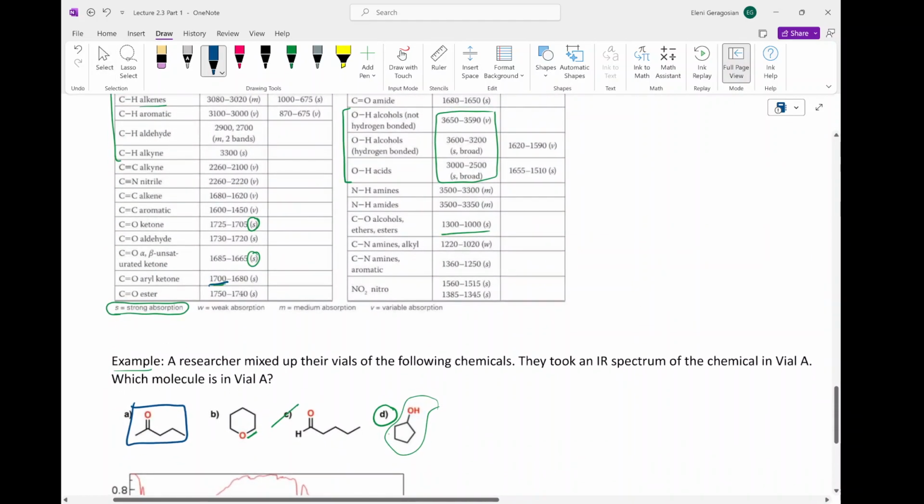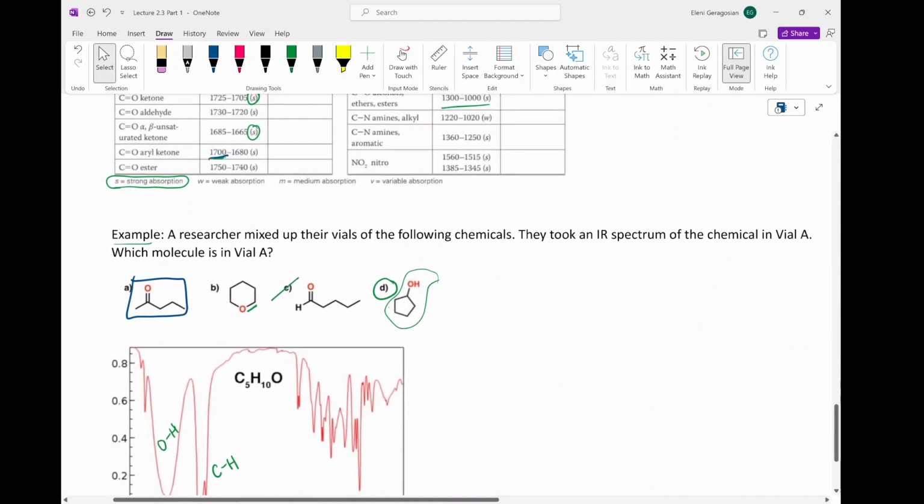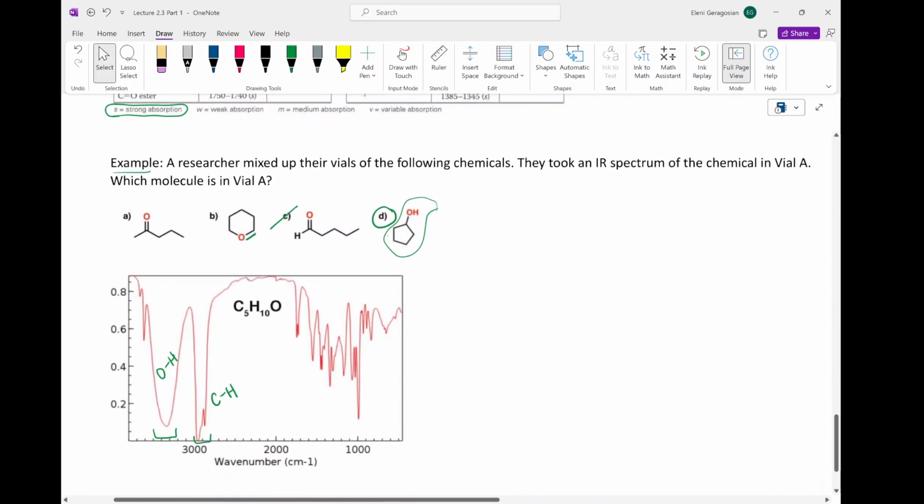We have carbon to hydrogen single bonds in the alkane chain, so we'd expect a peak here. And that's it. Those are the types of bonds that are present, so we'd expect those 2 peaks for that molecule, for example. So you'll see different types of IR questions.